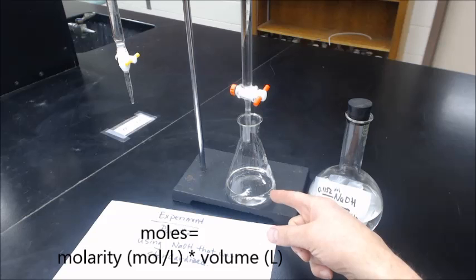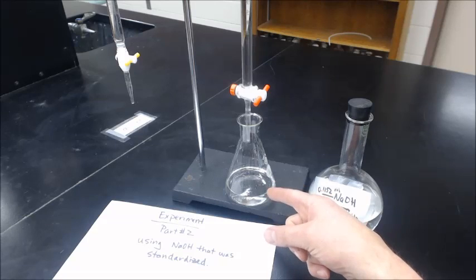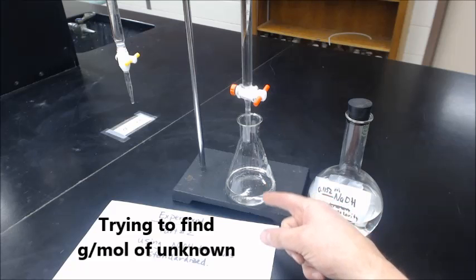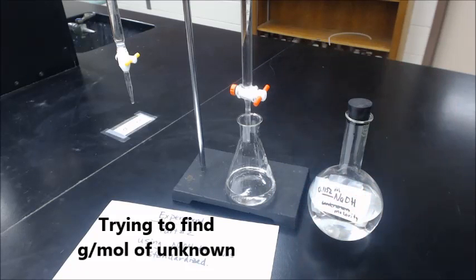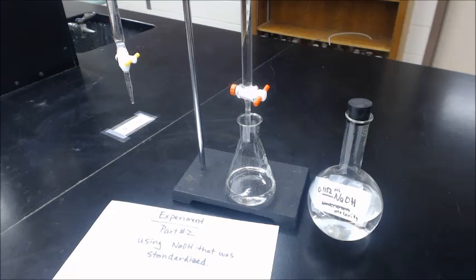Now, if we were to figure out something about the acid, we know how much we have weighed out in grams of the acid. The number of moles of acid in here are equal to the moles of base in the burette, or actually in the solution that we dispense.